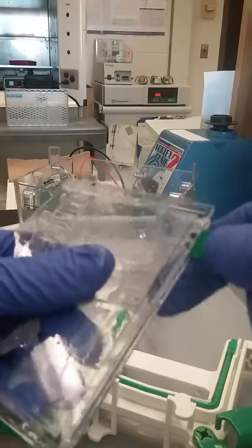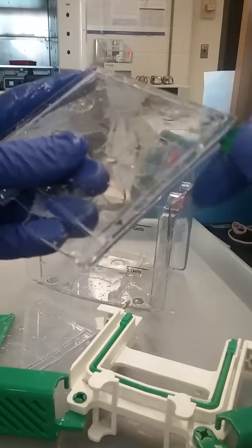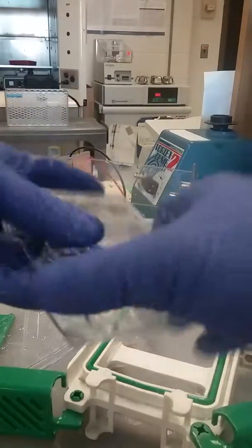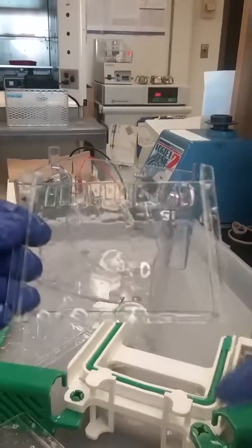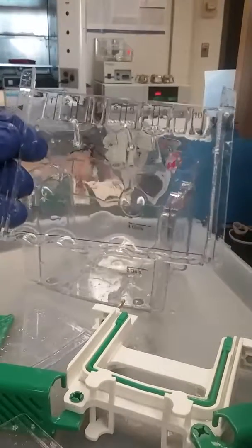Here we have the gel — a fairly thin gel. With a little twisting motion, this usually comes off on one side of the plate, and we'll just take this gel off into water, and then we can put it into stain later.